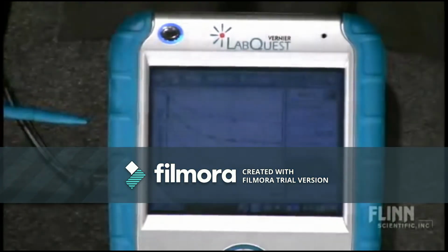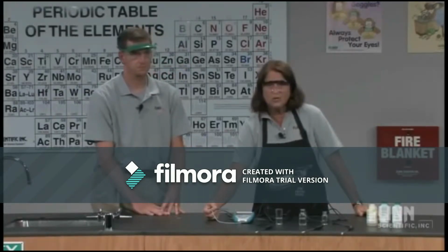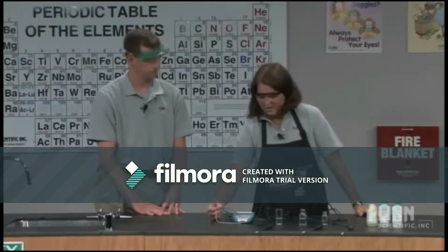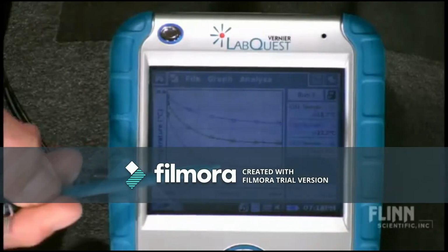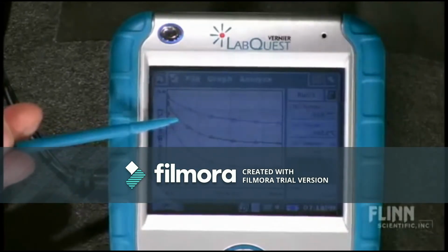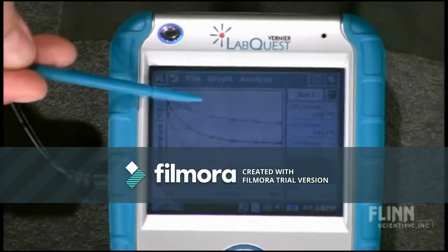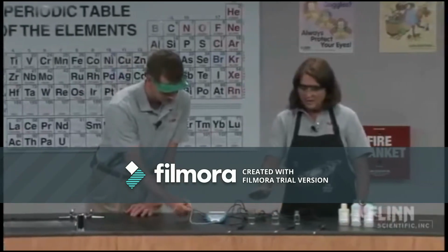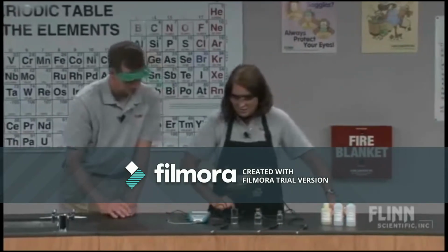So which would be which? Well, if it's the methanol that has the weaker forces of attraction, then the methanol is going to evaporate faster, and you're going to see greater cooling effects. This would be our methanol. In the middle, we would have our ethanol, and then the top graph would be for the propyl alcohol. So, what would I want to do with this? Well, this means that I can now identify which alcohol is in each of the bottles.